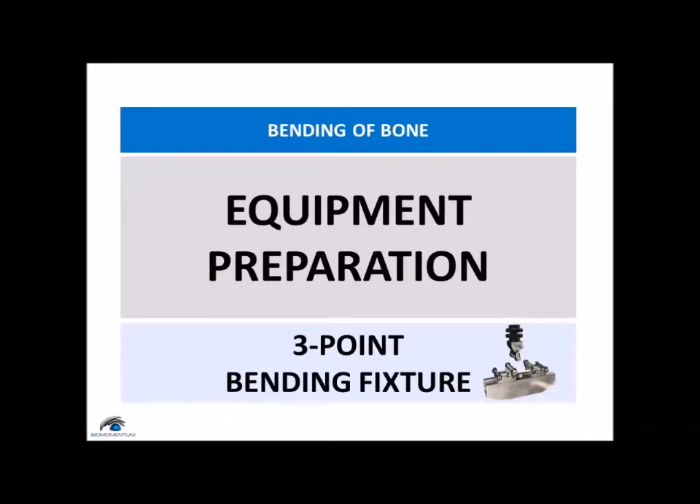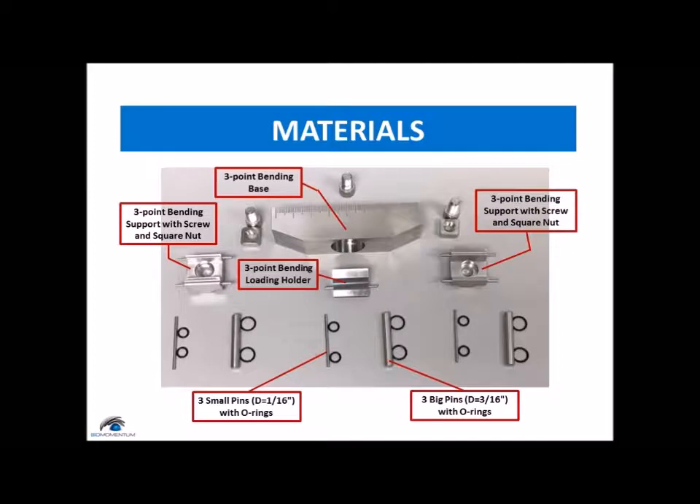The setup of the three-point bending fixture. We will be using a three-point bending base, two three-point bending supports with their screws and square nuts, one three-point bending loading holder, three big pins, and three small pins with their o-rings.